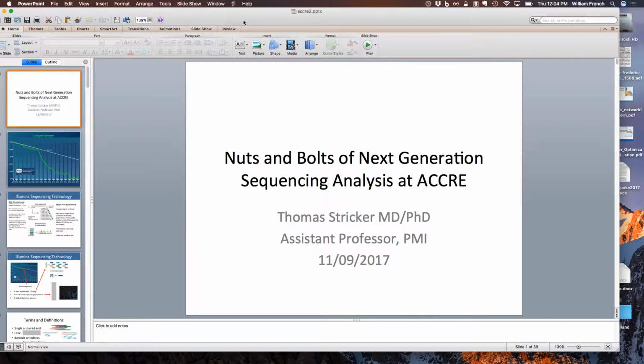Thanks, Will. So I've never given a talk quite like this before, so we'll see how it goes. I wasn't exactly sure on the audience, so we're going to start with a little bit of how Illumina sequencing works and the molecular biology behind it, because that is going to be important for the analysis. We'll define some terms, and then we'll walk through how I do things for a couple different pipelines. And we'll stop there.